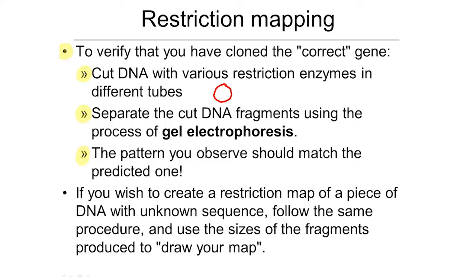Say you had your original plasmid. We said there was an EcoRI site in it, right? And let's say now that you put your human insulin gene in there, we didn't use it to cut, but let's just say we happen to know for a fact that there's a BglI site inside the insulin gene, right? Now, wherever this EcoRI site still exists. So in other words, say you isolate your plasmid and you digest it in one tube with EcoRI, right? Well, actually, I'm going to add one over here. Let's put a HindIII site here.